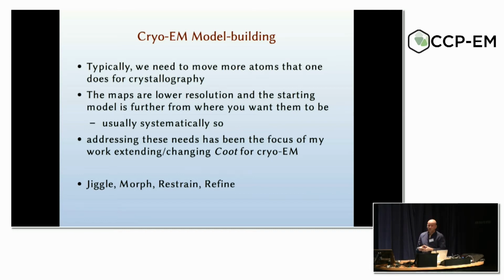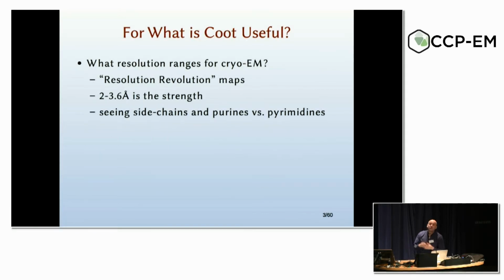These things have been improved as a result of conversations with my colleagues. Oh, G&P, thank you for reminding me. If you aren't using G&P routinely when you're doing your model building, then let me encourage you to learn about the key bindings and give them a go. I find I'm using G&P very frequently for navigation, to move around the structure.